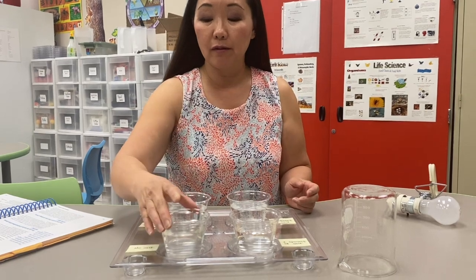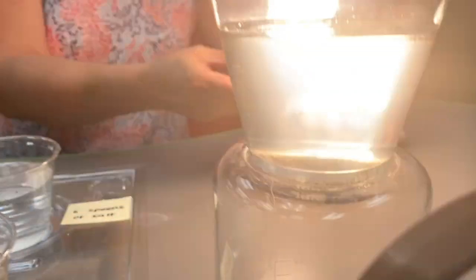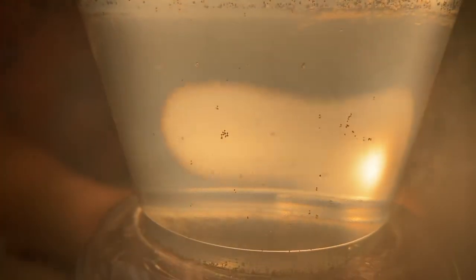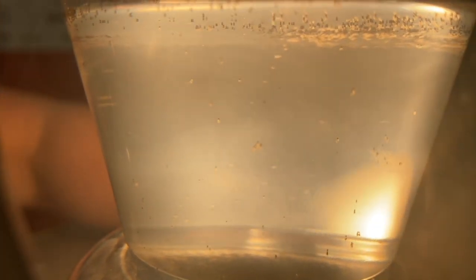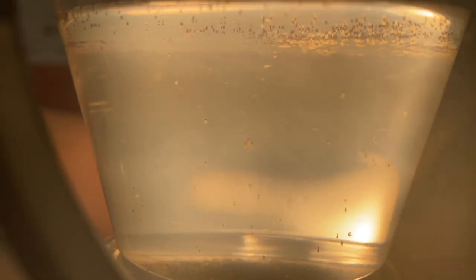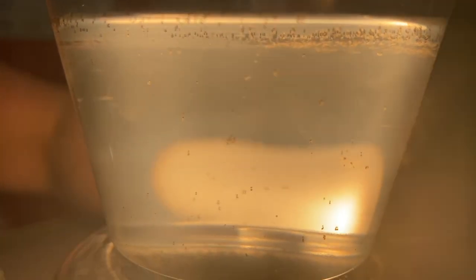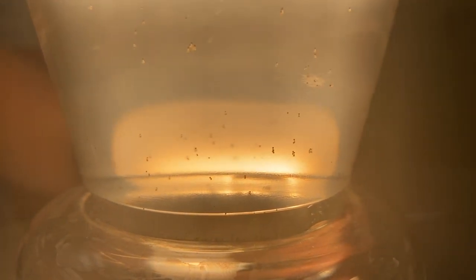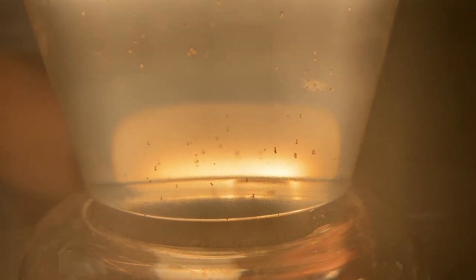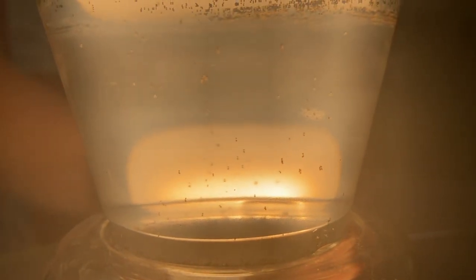First off, we have the cup with no salt in it, and we're going to look to see if any brine shrimp have hatched. It's kind of hard to tell if those are brine shrimp or just eggs, but they don't look like they're swimming around — they just look like they're floating.